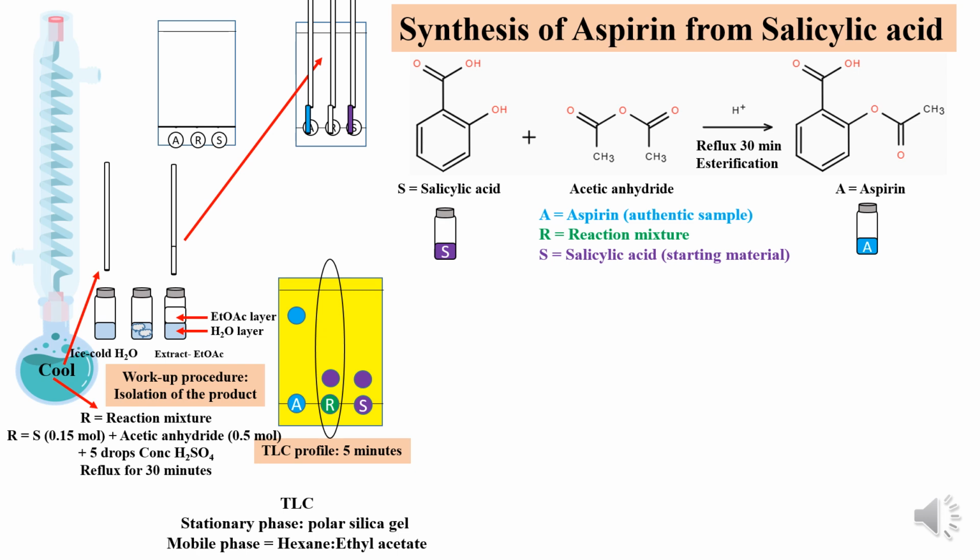you will find that the reaction mixture still contains unreacted salicylic acid. So when you compare the reaction mixture spot to that of the salicylic acid spot, you'll find that they have traveled the same distance. So this indicates that the reaction has not started or initiated. So there is no reaction, as salicylic acid still remains in the reaction mixture.